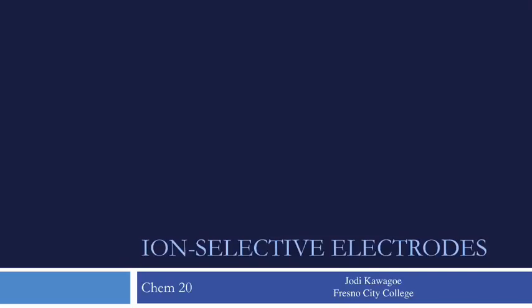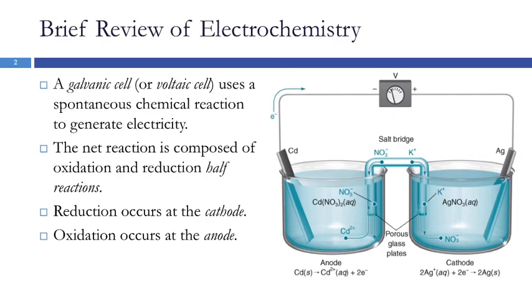Okay, so this will be a brief lecture on ion-selective electrodes. Before we can talk about the electrodes, we need to briefly review electrochemistry. I know you've all had electrochemistry in Chem 1B, but it might be a little fuzzy. So we'll just go over the basics we need to understand.